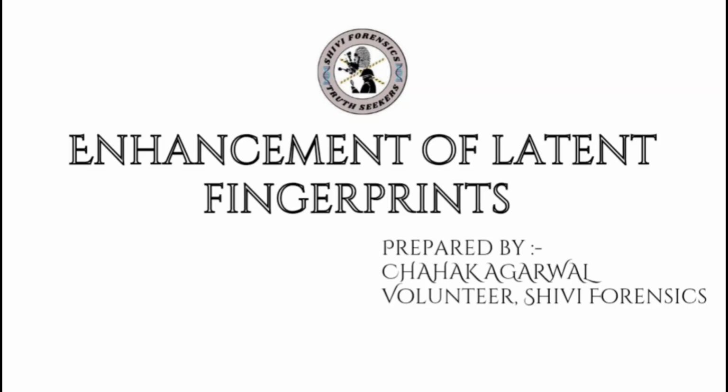Did you know that every time you touch something, you leave behind an invisible fingerprint? These latent fingerprints have revolutionized forensic science, helping solve crimes with remarkable accuracy.